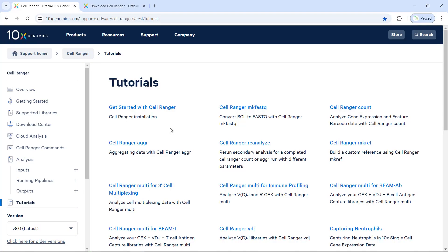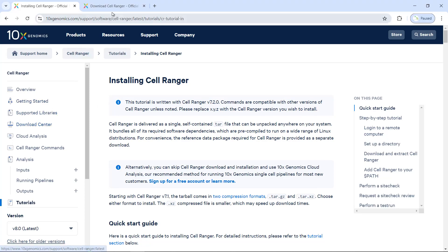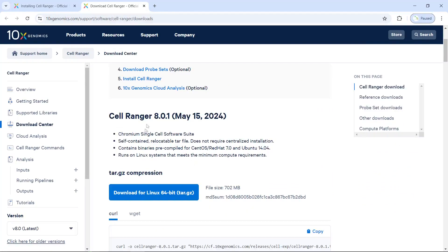The CellRanger software was developed by the 10x Genomics company. If you go to the 10x Genomics website, you can find the tutorials page and Get Started with CellRanger. Clicking that link shows you how to download and install CellRanger step by step. The page demonstrates using CellRanger version 7.2.0, but if you go to the Download Center, you can see the latest version is 8.0.1.